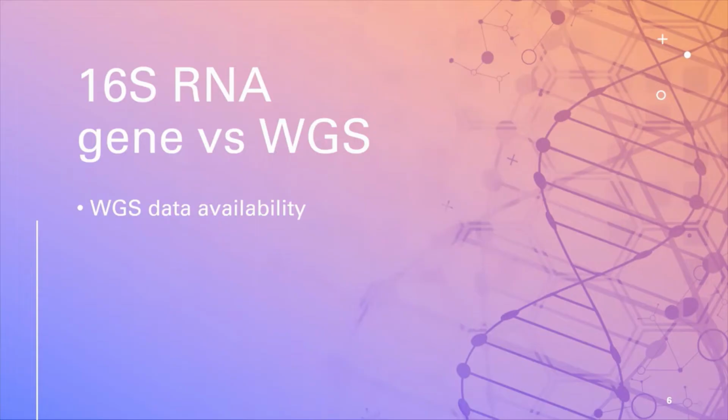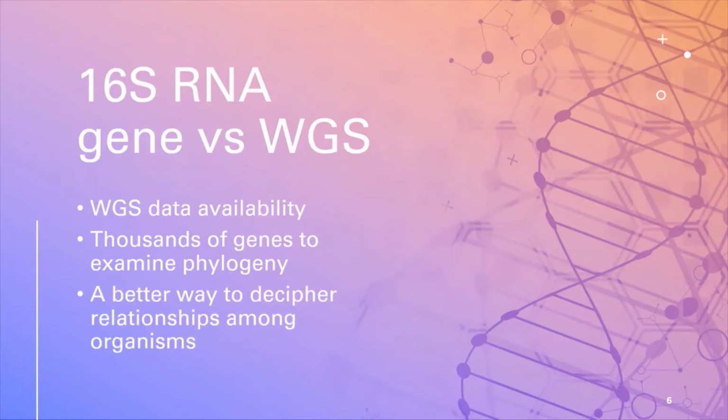With cutting-edge advancements in multiomics techniques, now more than ever, we have a lot of WGS data at our disposal. So like I said earlier, trees constructed using 16S are based on a single gene. On the other hand, WGS offers thousands of genes to examine a phylogeny. So WGS is often considered a superior way to decipher relationships among various organisms.